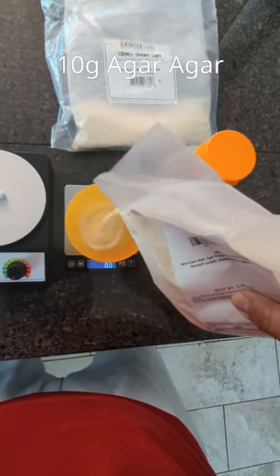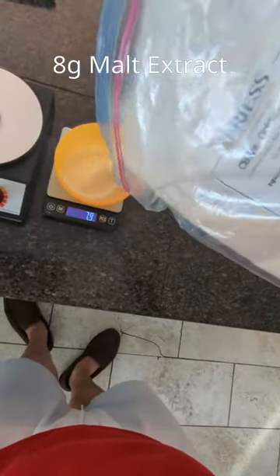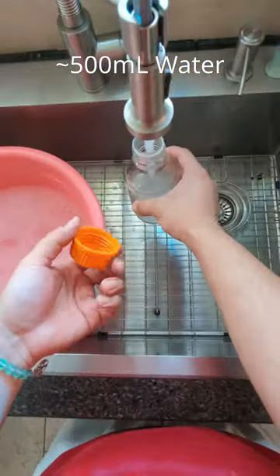Today I made some petri dishes with 10 grams of agar agar, 8 grams of malt extract, and 500 milliliters of water.